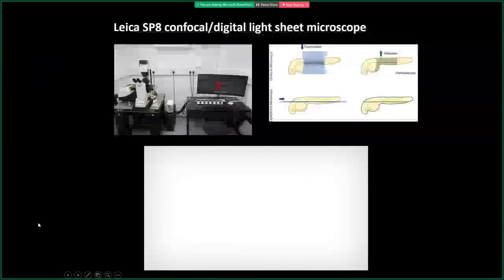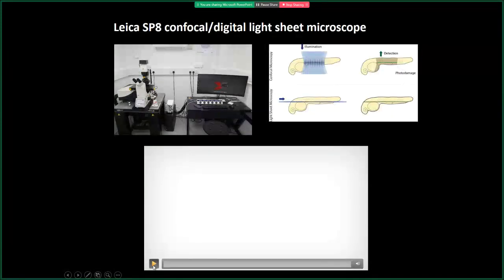To illustrate that, I'm just going to show you a short video. It's not one we made. It's a video from the manufacturers of this microscope, Leica, and it illustrates how light sheet microscopy actually works. So I'm not going to say anything much during this.